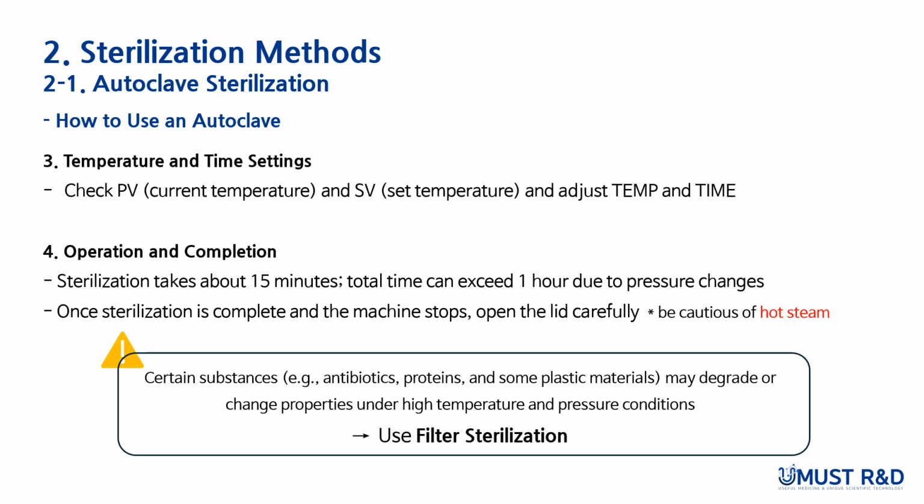Autoclaving is effective for sterilizing microorganisms using high temperature steam, but heat-sensitive materials like antibiotics, proteins, and some plastic materials may have their properties changed or degraded in such an environment. In these cases, filter sterilization should be used instead.